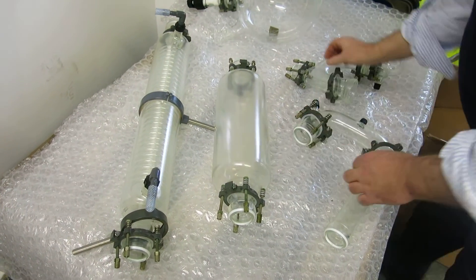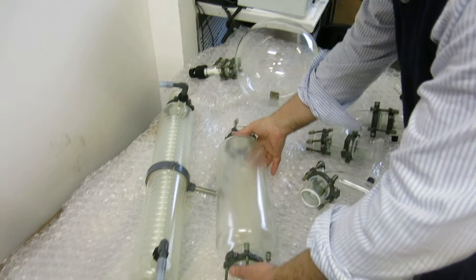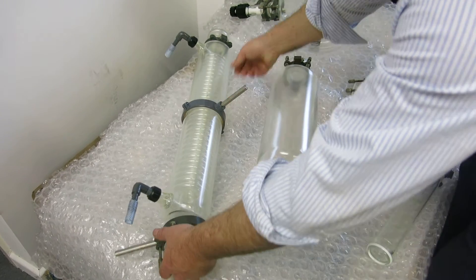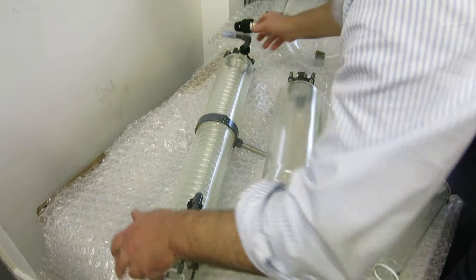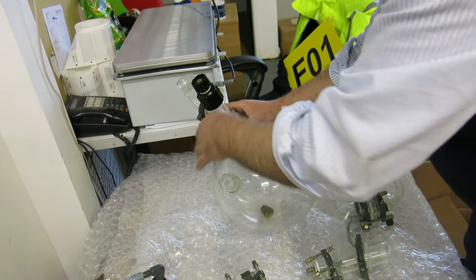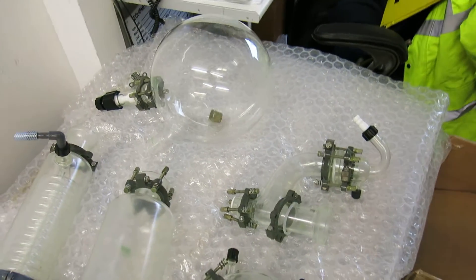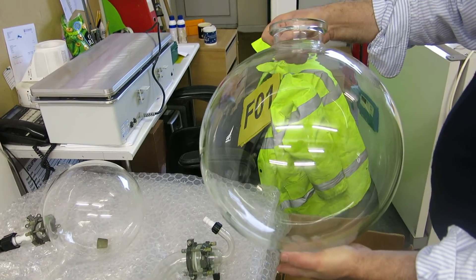These have all been greased — you can see that this is all in good order. Same with this one here; we've all got Vaseline on there. You can see that the condenser is intact with no breakages. I've got the vessel here — again, got the quick fit there. And finally, there's a cork in there which can be dissolved with some acid, and then we've got this Buki 20-litre flask as well.